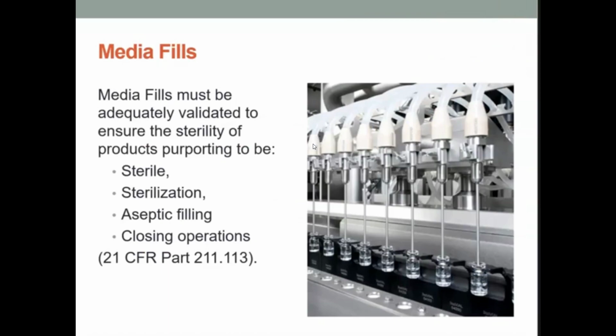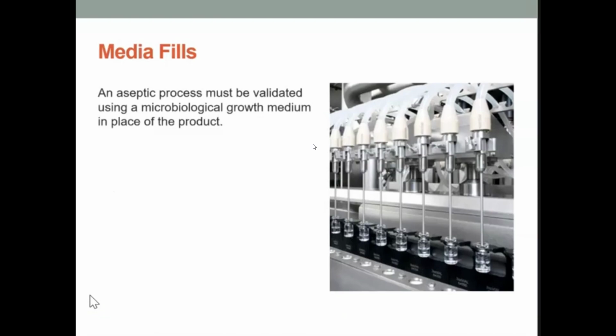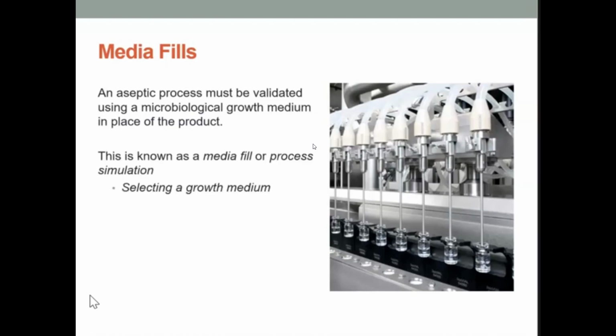Media fills. 21 CFR Part 211.113 details that media fills must be adequately validated to ensure the sterility of the products. Media fills are an aseptic process that must be validated using a microbiological growth medium in place of the product. This is known as a media fill or process simulation.